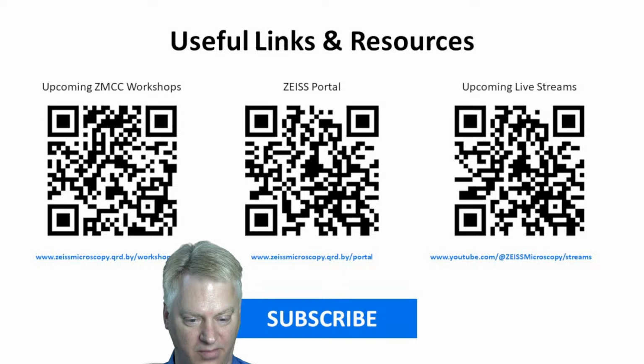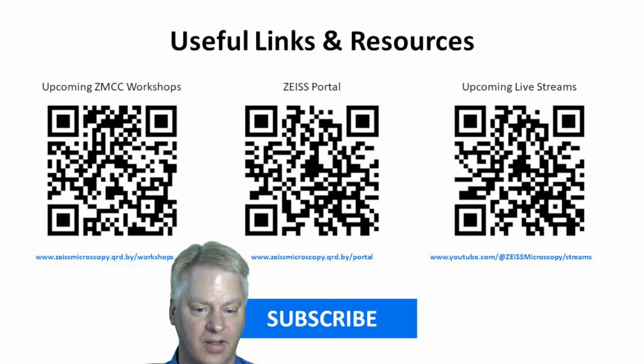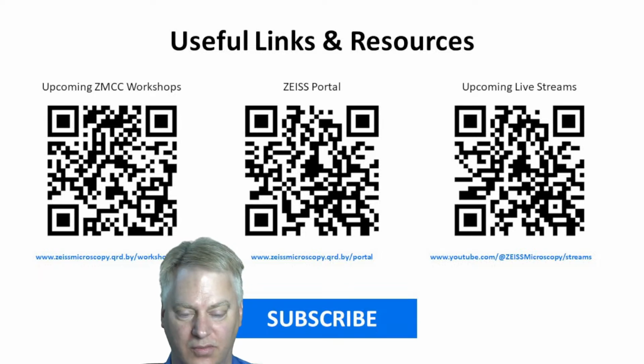And the video for lamella prep, I don't know if we still have that up, but I'll check back with you on that, and I'll post it back on the chat. I need to see where that ended up. Anyway, hopefully that answers your questions.